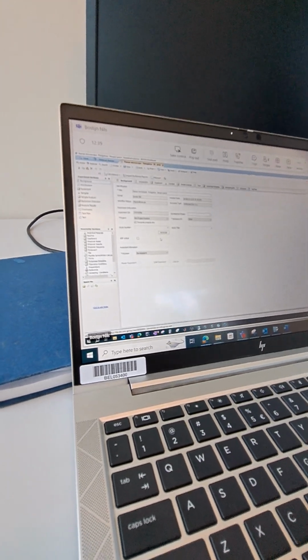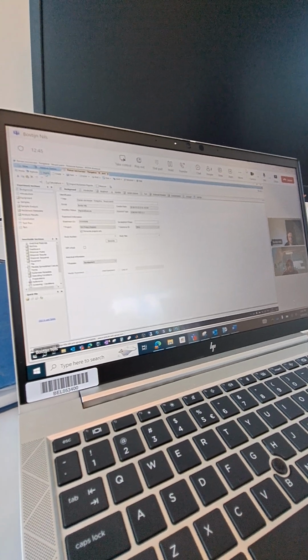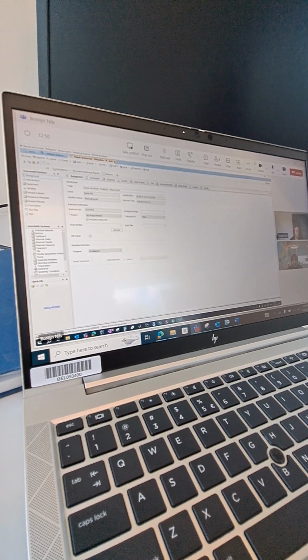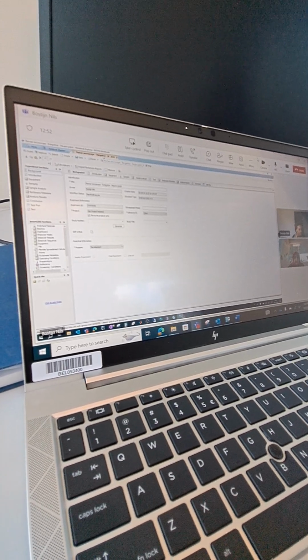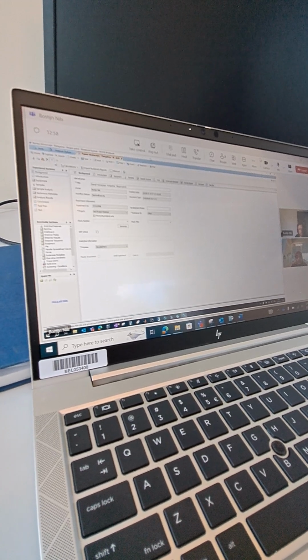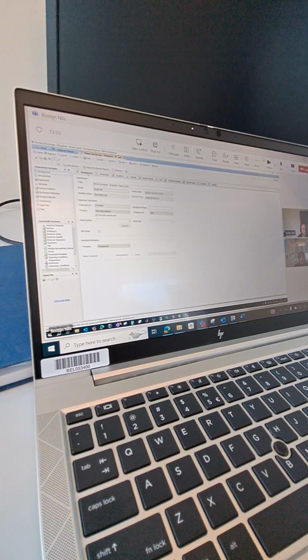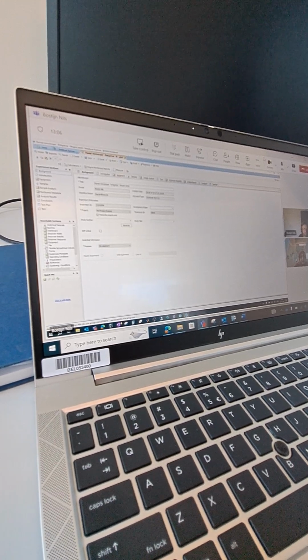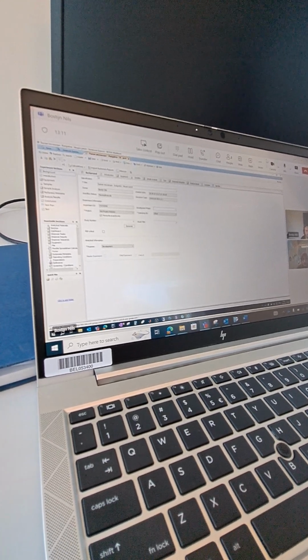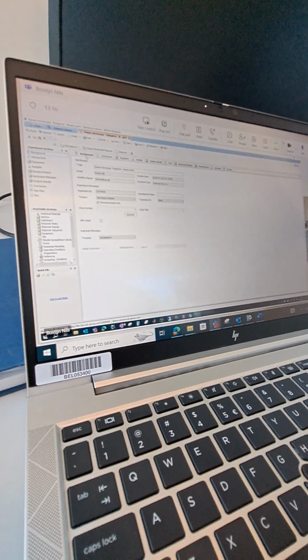So when you have clicked finish, what I showed before, this is what opens. And this is in fact the ELN. You can see here that a new tab opens, and in fact each tab is one ELN. So you can open multiple ELNs and there will be multiple tabs, like on Internet Explorer or something. Within our ELN we also have different sub-tabs, and these are the kind of information we will need to fill in our ELN. The first one is background.